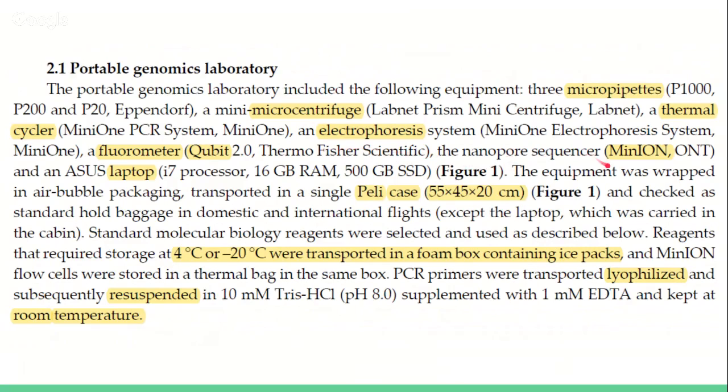The nanopore sequencer, MinION, and a laptop. And they describe here the specs of the laptop. And they say they can put all these into a Peli case of 55 by 45 by 20, and I'll show a picture of this.